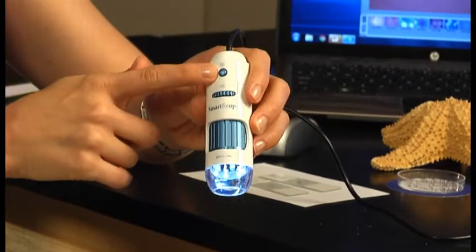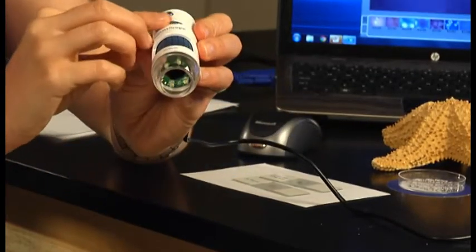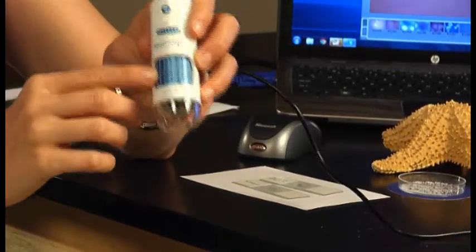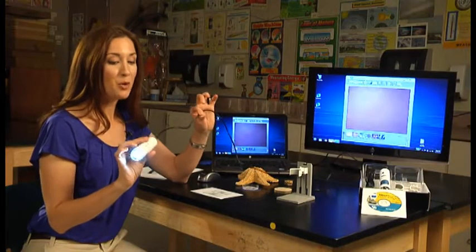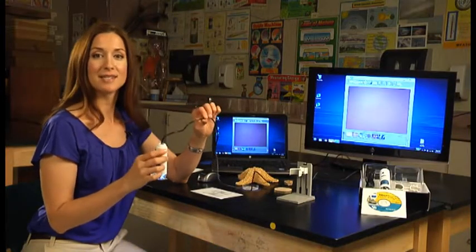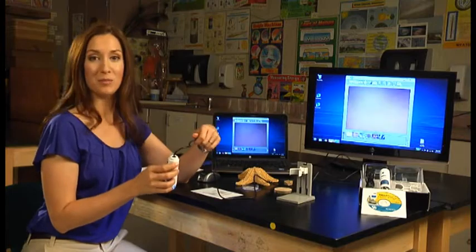The top one takes a picture. The middle one controls the lighting. And your bottom dial is your focus dial. As you can see, no batteries required. This actually gets its power when you plug it into the USB port.